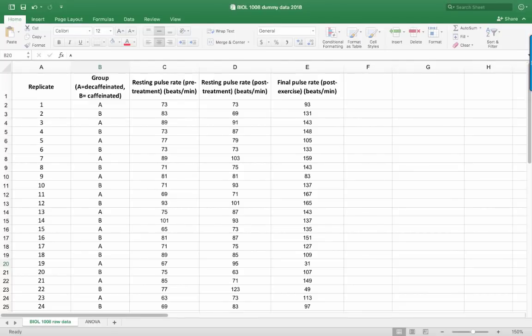Hello, it's Hong here. I made this video to help guide you through the process of analysing the raw data collected from the caffeine experiment in your practical. What I have here is some dummy data, and the spreadsheet you would have downloaded from Canvas is also structured in the same way, so we can work through our datasets at the same time.